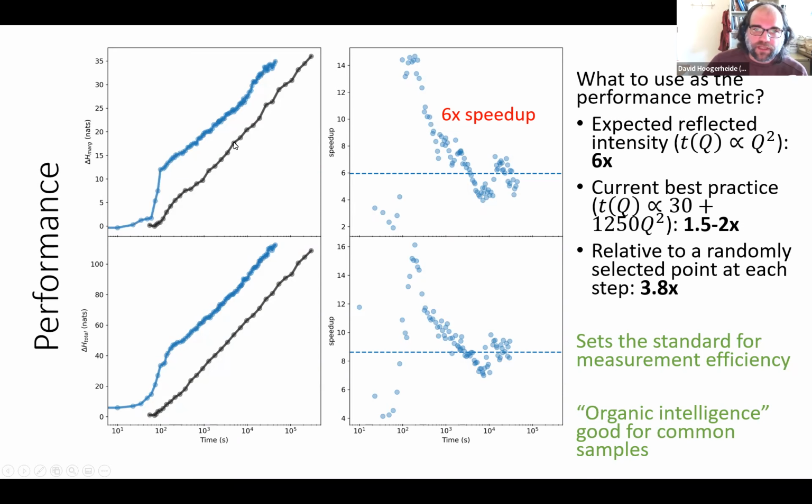And what each point here means is I have some scheme that I usually use for taking data. I say I have a total time here of say 10 to the 3 seconds, and I'm going to distribute that time among those points according to this weighting factor. Then you simulate data with that total time with that scheme, and you look at it relative to the autonomous scheme.